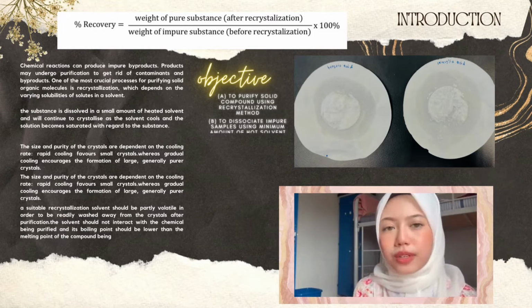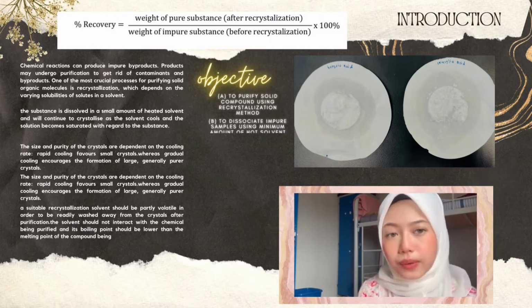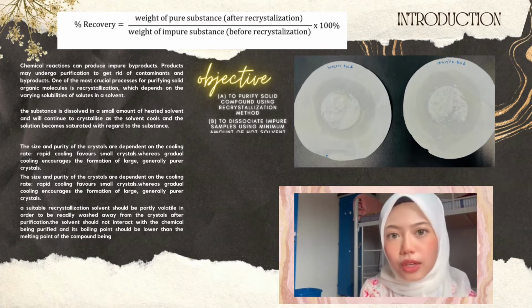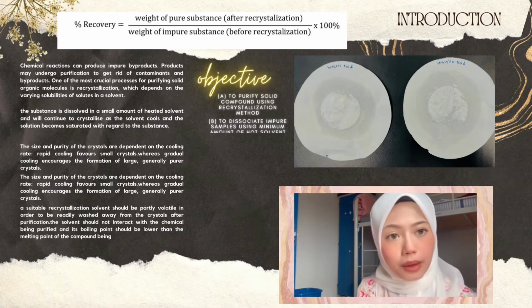Additionally, a suitable recrystallization solvent should be partly volatile in order to be readily washed away from the crystal after purification. In addition, the solvent should not interact with the chemical being purified and its boiling point should be lower than the melting point of the compound being purified.